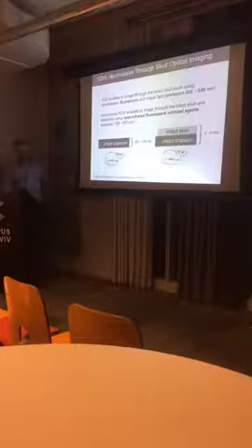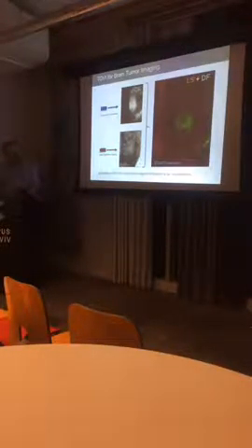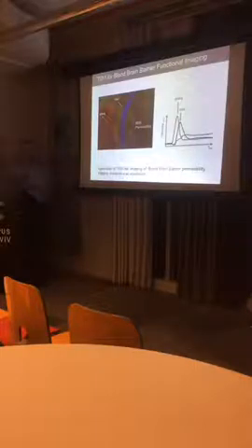So this is like a conclusion of what we can do using this method. I also can combine them, see the tumor model, and of course we can see, using this combined technique, blood-brain barrier function.